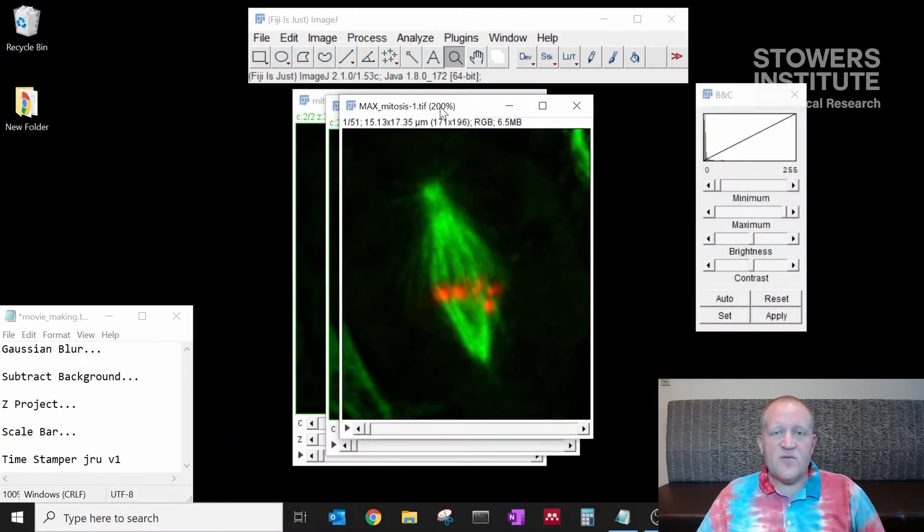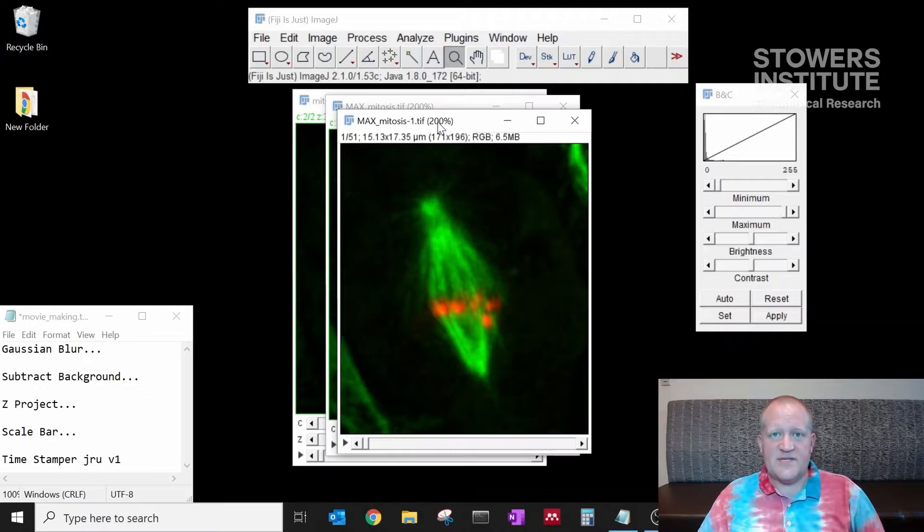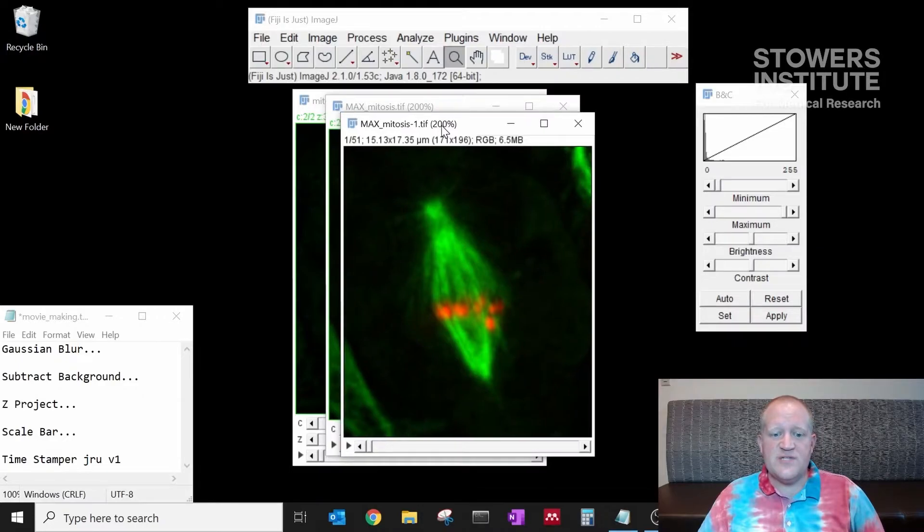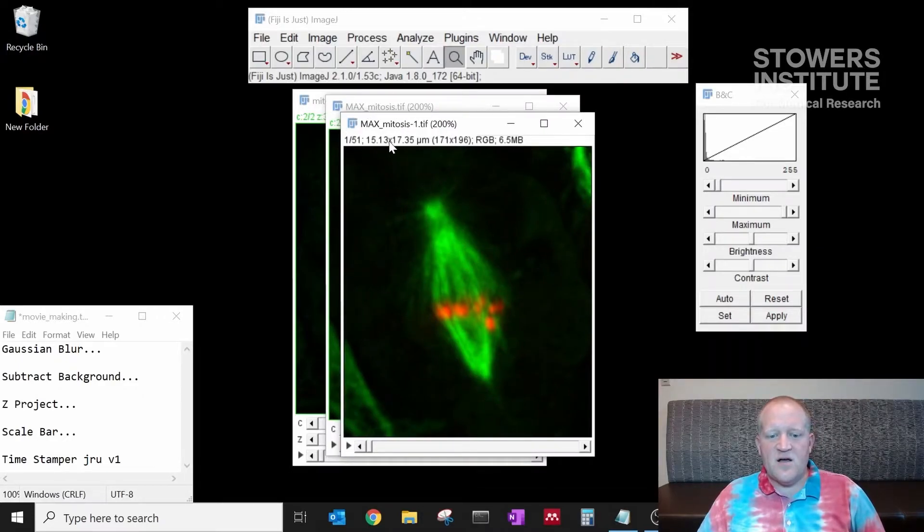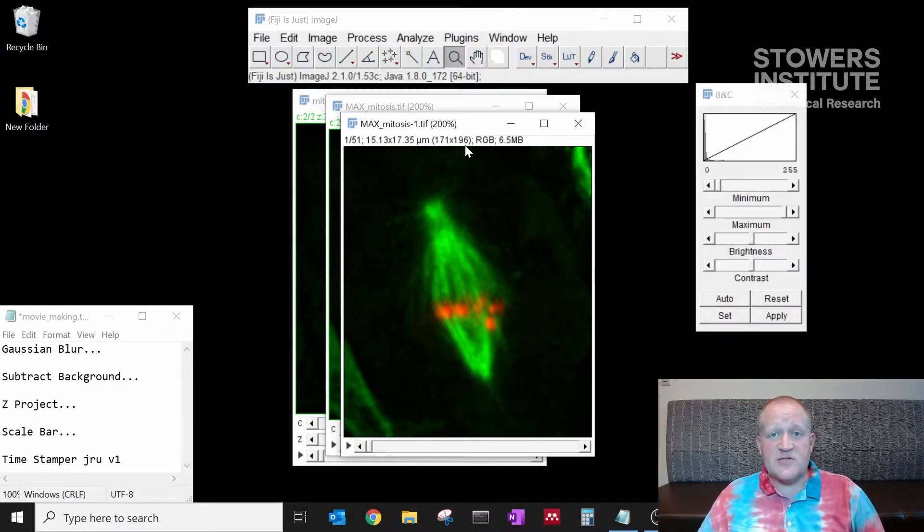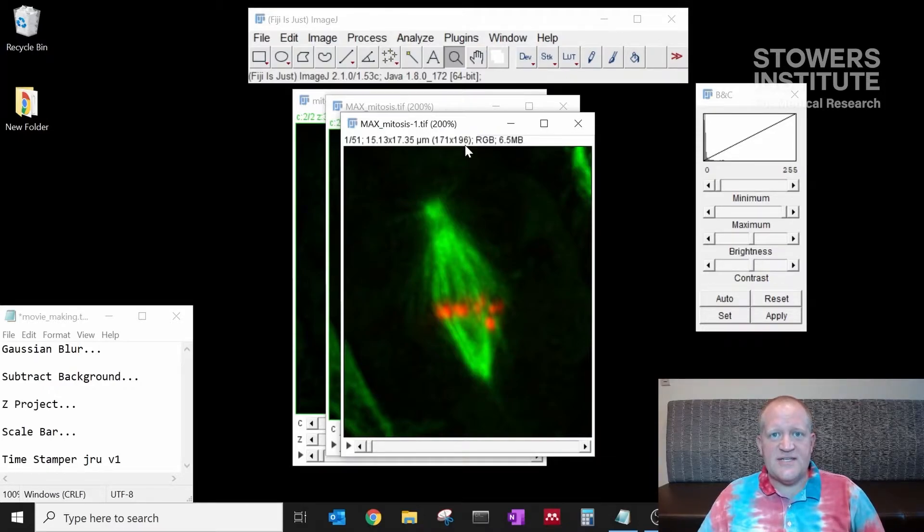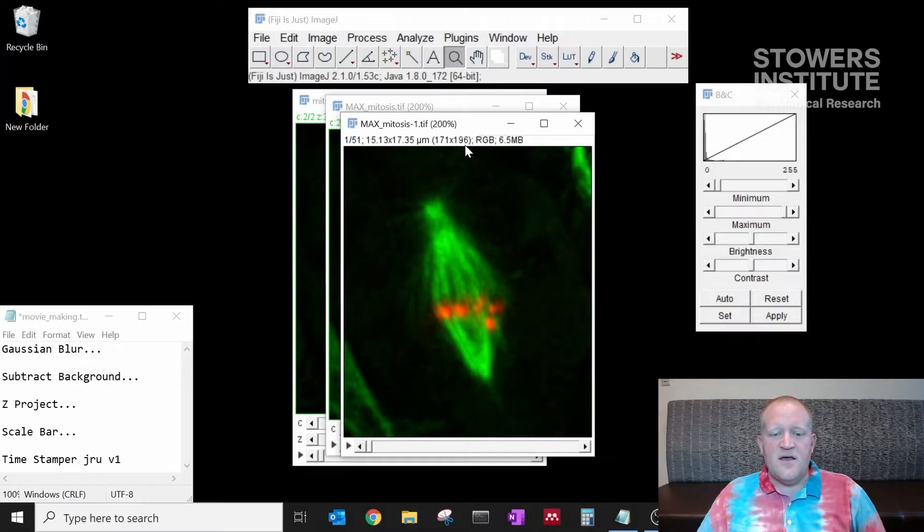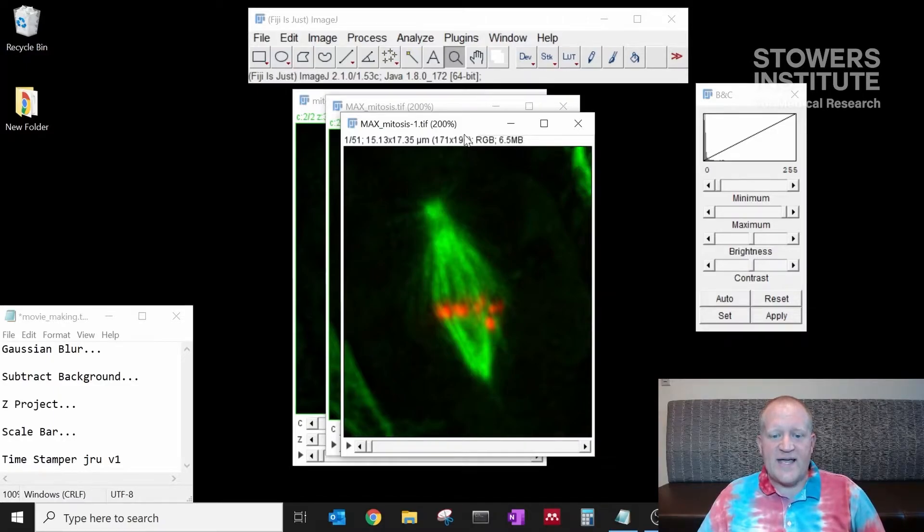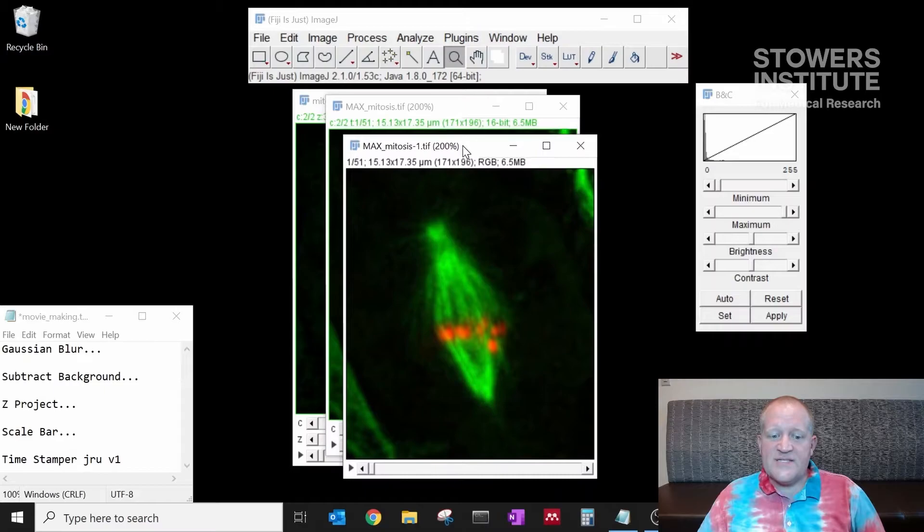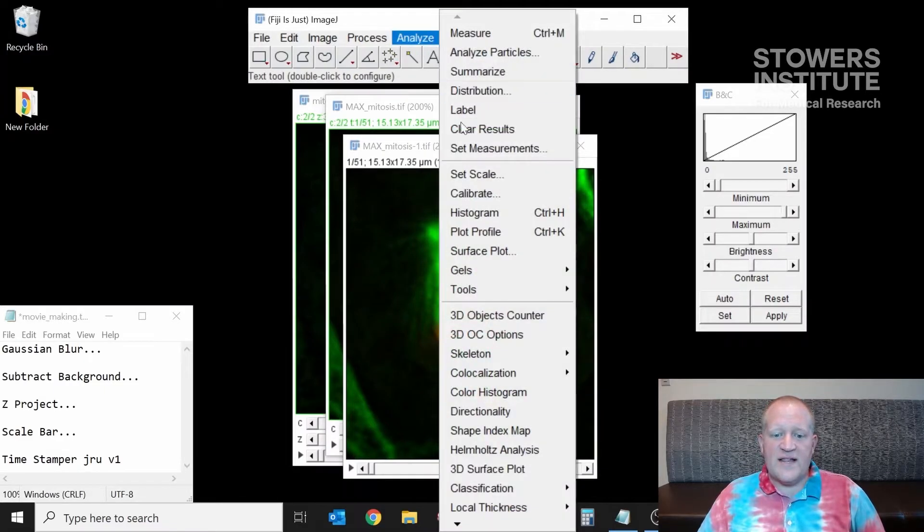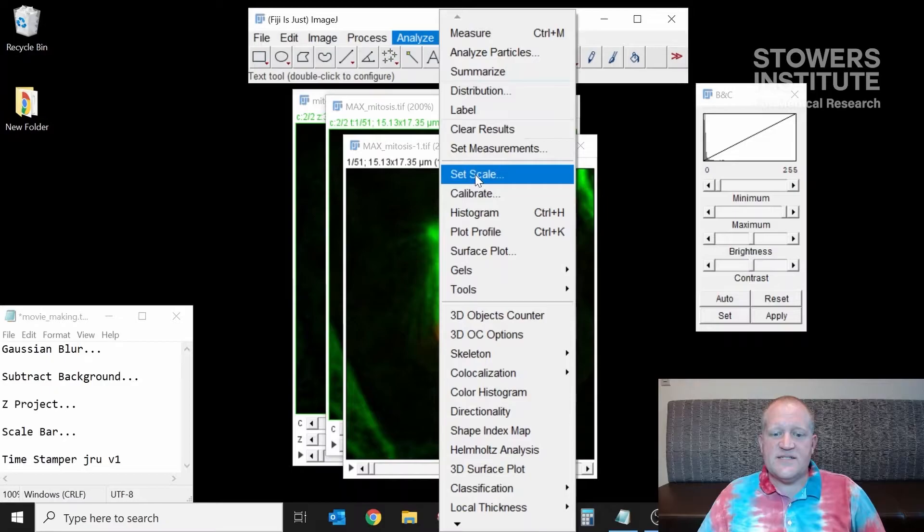Now that we're in RGB format we can add our scale bar and our timestamp. We'll notice here that our image is 15 microns by 17 microns with 170 pixels by 196 pixels. This means that our data has the scale already attached to the data and a lot of the times off microscopes that will be the case. There are some instances where you will not have the scale and you will have to set that scale going through Analyze Set Scale.